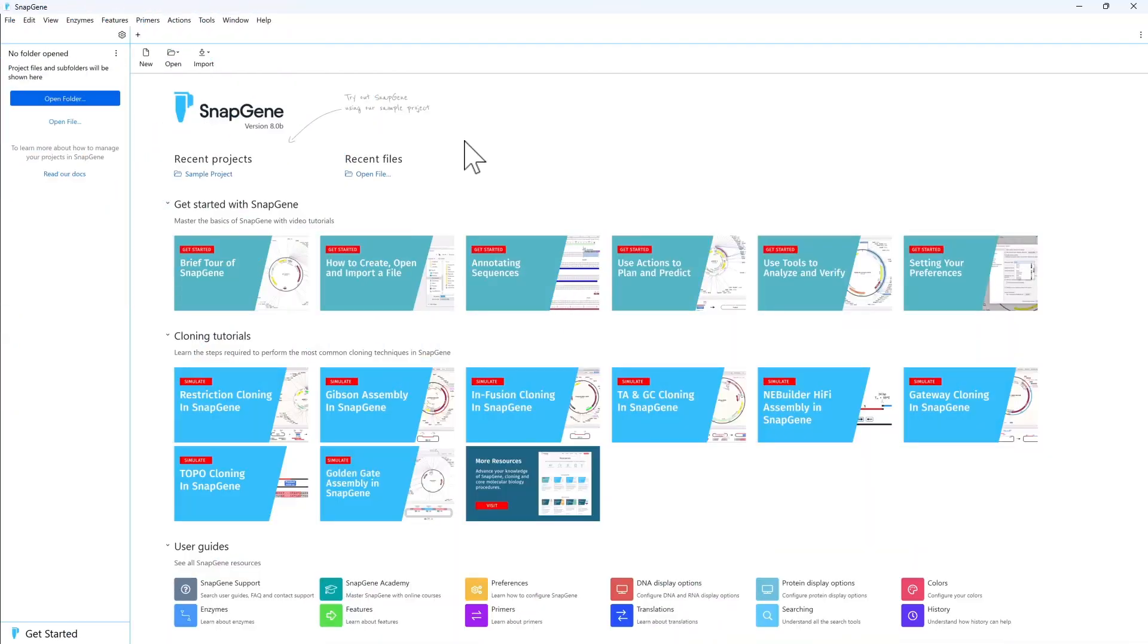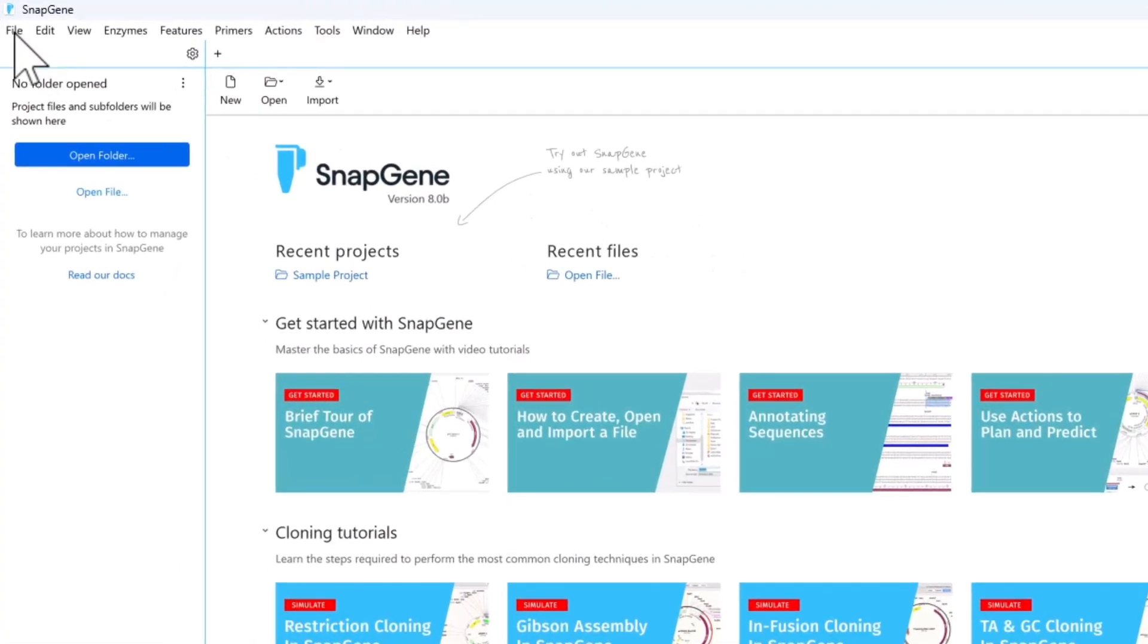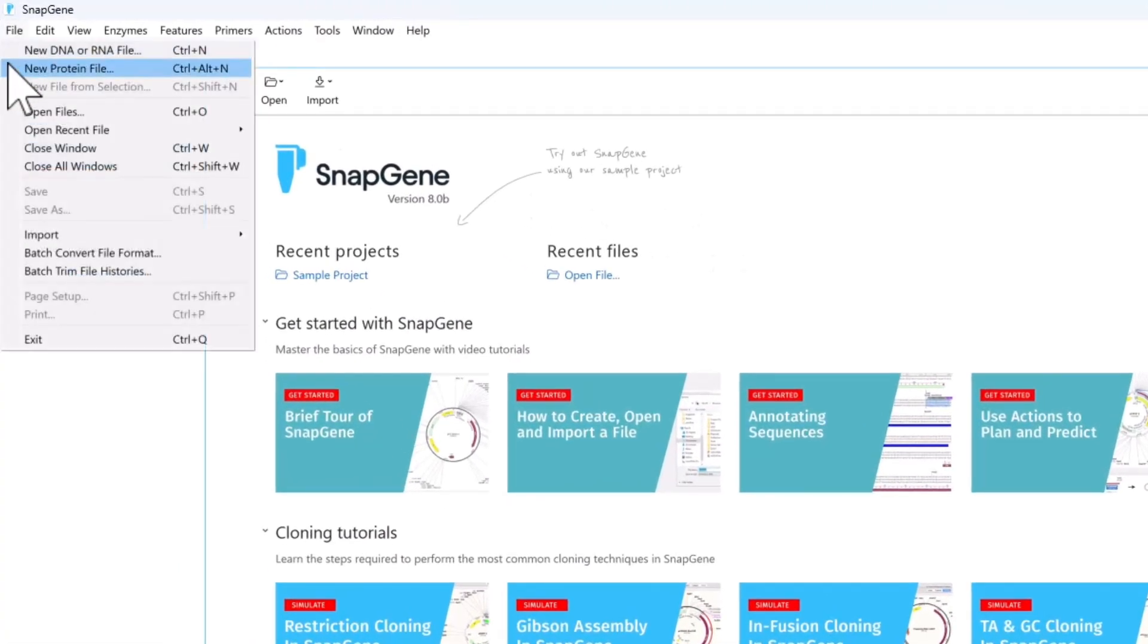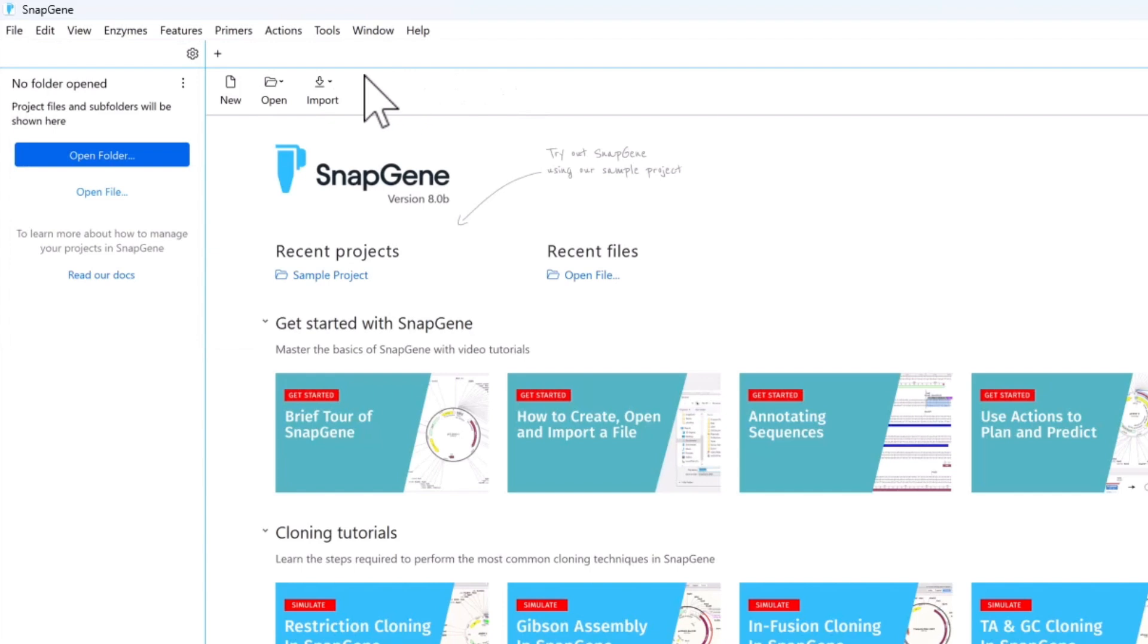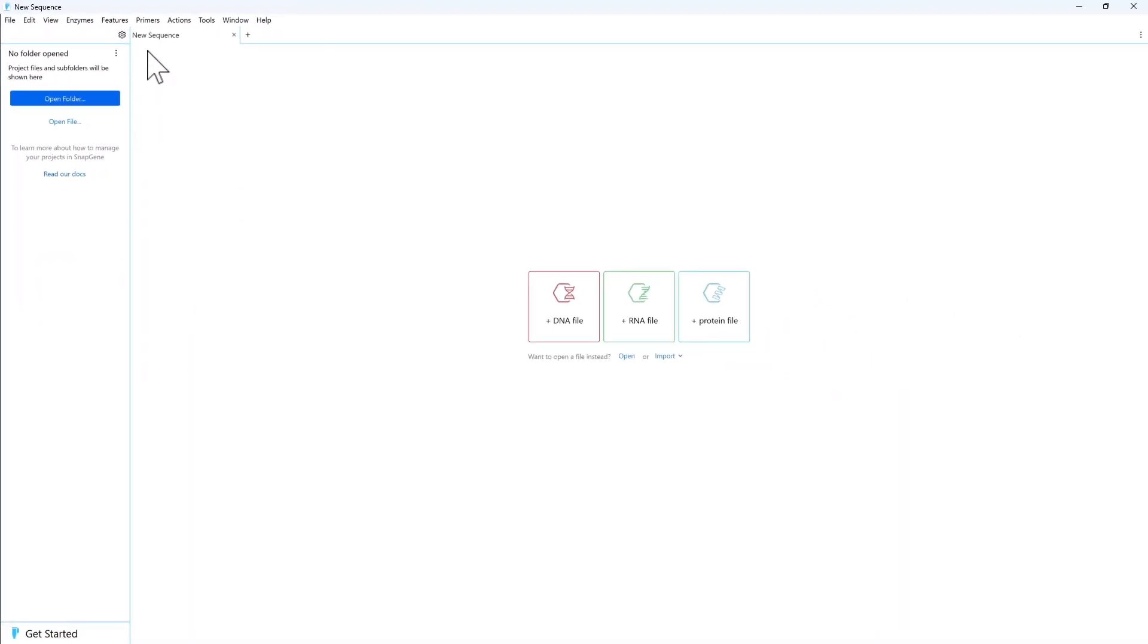You can create a new DNA, RNA, or protein file directly from the Getting Started screen, either from the File menu or by selecting New and choosing your desired file type.